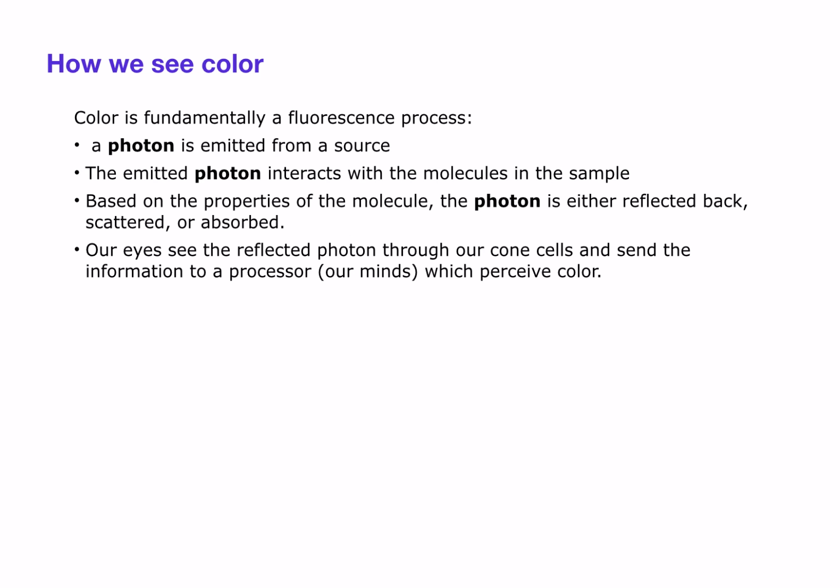The important point being that when we discuss color, we have 3 sources of subjectivity. The first source of subjectivity is our source. The second is the object that the photon interacts with, and the third is the detector. If we can keep the source constant and the detector constant, then all variation will be driven by the sample you have.